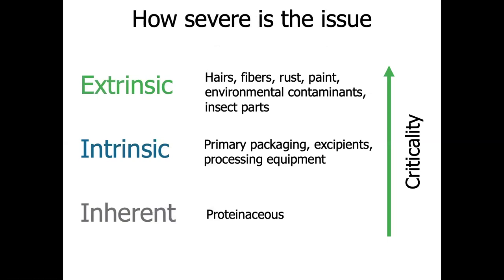It's also important that you can begin quickly answering questions about the particles you find, as they will often lead you down different paths in your process. For example, inherent particles — particles that come from the drug API itself, like protein aggregates — may fall within established limits you already have. So within your following of USP 1790, this might be data that just gets added to your trend data set, and that can be completely fine.